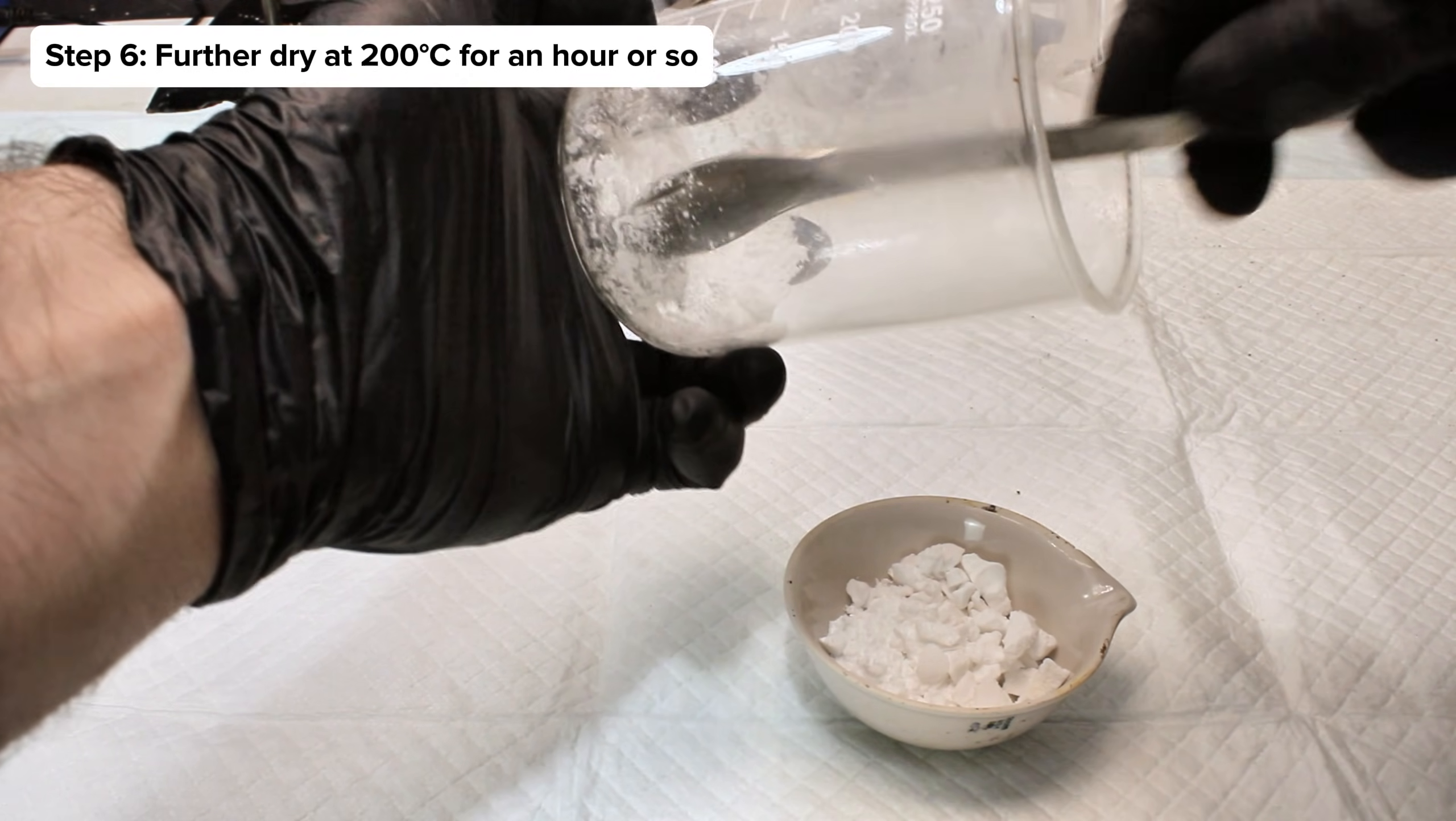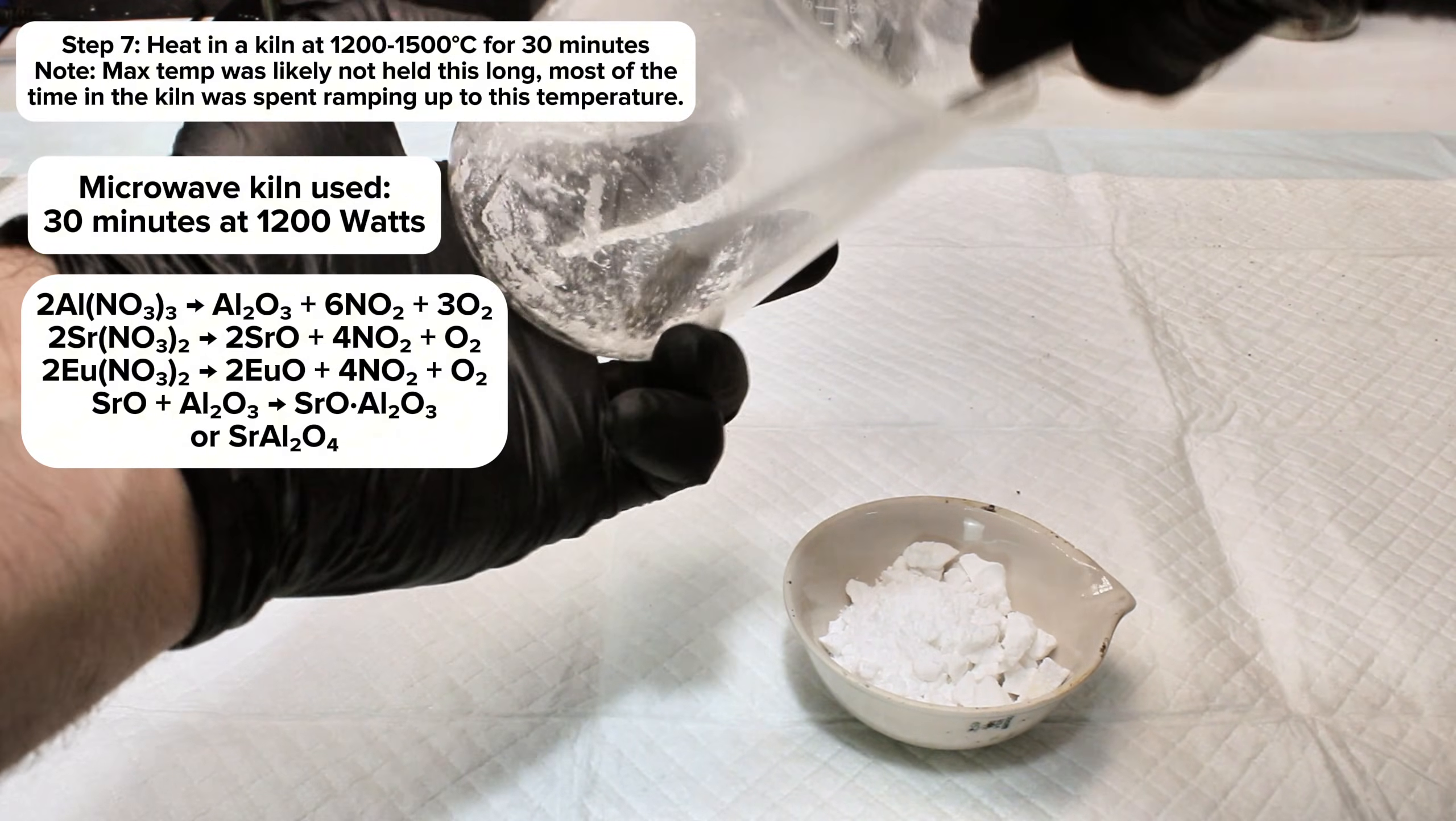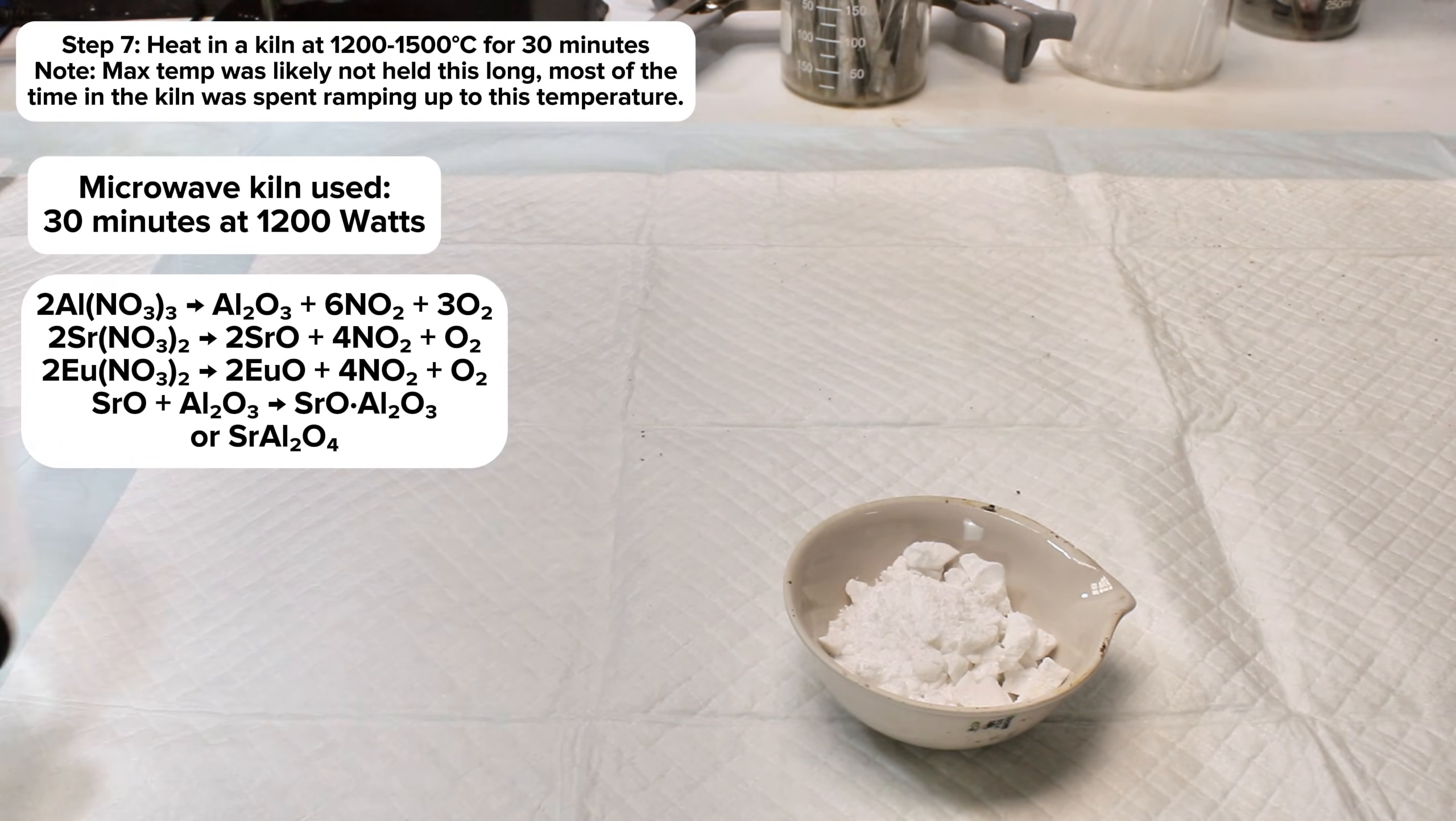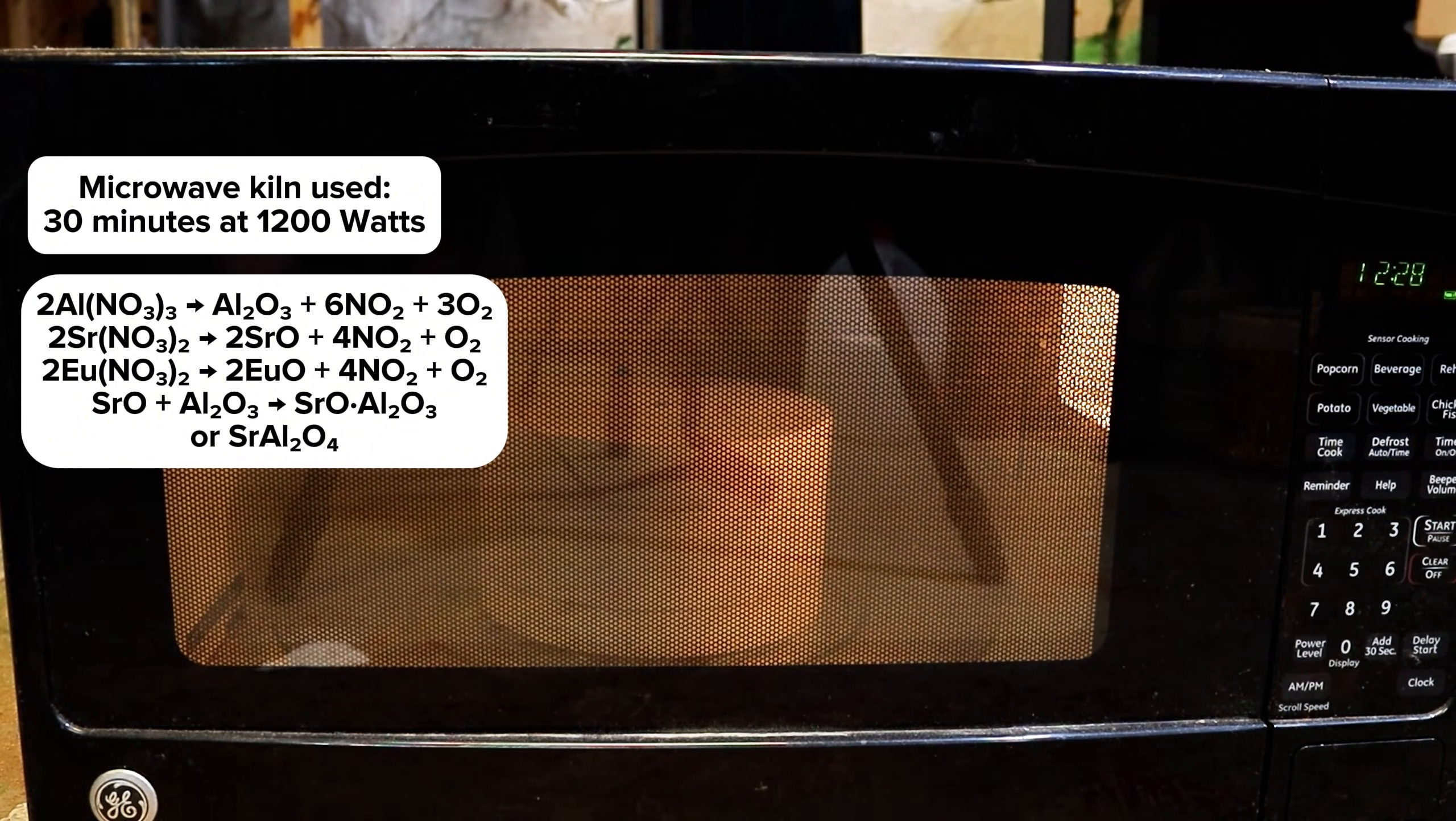This was then transferred directly into my microwave kiln and fired for exactly 30 minutes at 1200 watts. The idea here is that the extreme heat produced by the microwave kiln should decompose each of these metal nitrates to their respective oxides, which will then fuse together to form the target product.